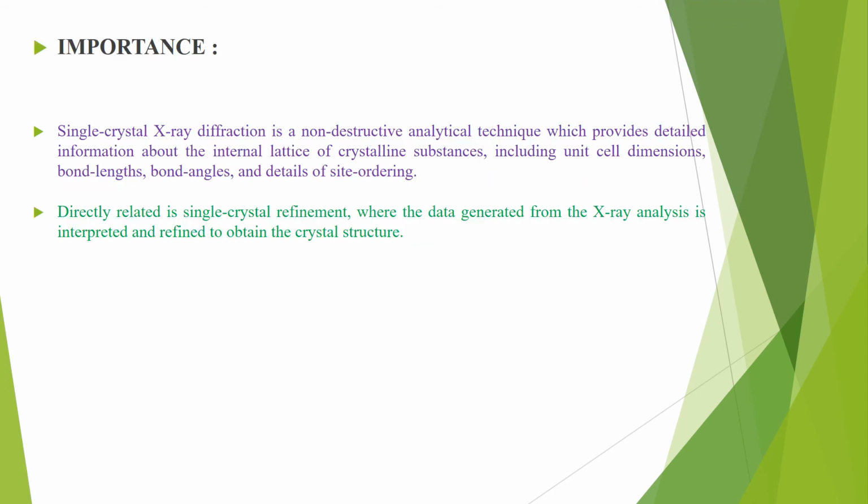Dear student, now we are going to discuss some importance of the single crystal X-ray diffraction technique. We know that single crystal X-ray diffraction is a non-destructive analytical technique which provides detailed information about the internal lattice of crystalline substances.